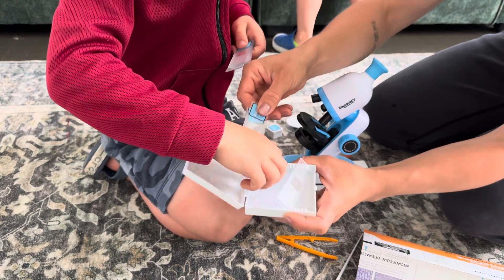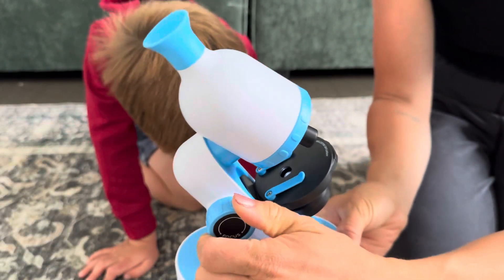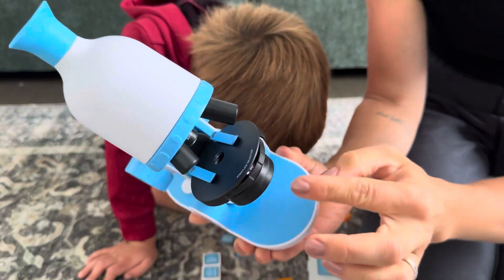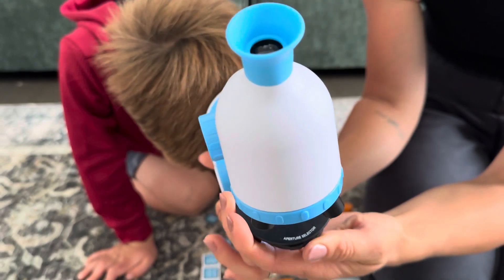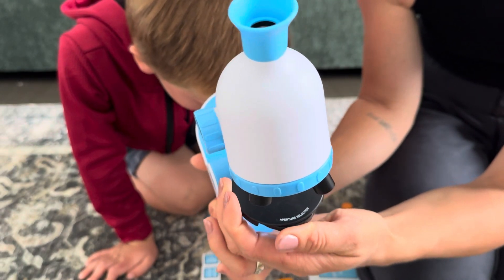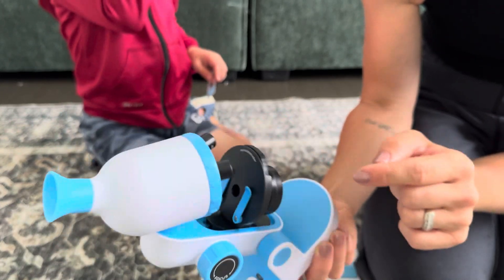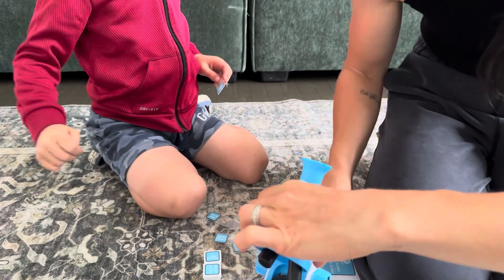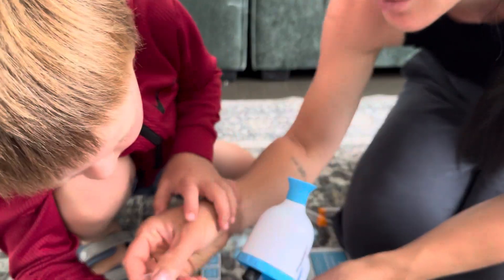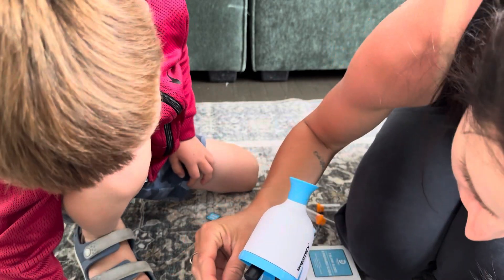So this is cool guys — here is the button, here is the focus. You see the light? It features multiple lights: green, blue, and red. And here is our lens. This is actually pretty cool. So let's put our first specimen — what do you want to put? Camellia pollen? Okay, let's put it right here.